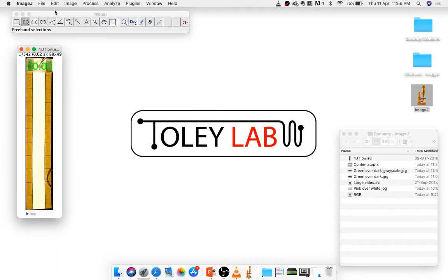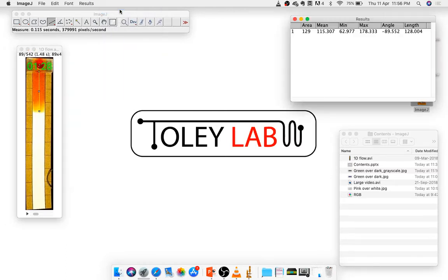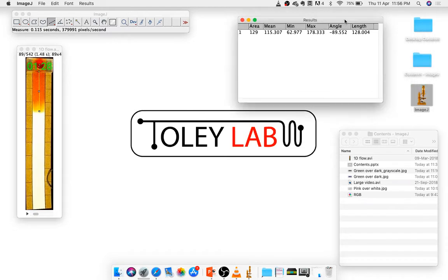So let us now start. Let's say I want to measure the distance. Let's take a certain time point. Let's say the fluid front is here, and I want to measure, let's make it somewhere in between the gradations, the distance from this point here to this point. It's very simple. I can draw a line. This is the line selection from whatever point to whichever point I want, and I can again do Analyze, Measure, and now it's telling me that the length of this segment is 128.